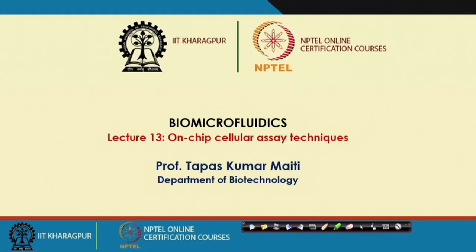In the present time, a number of experiments based on fluorescent microscopy in the microfluidic platform have been adopted to understand biological events. In this lecture, I shall be discussing some of those microfluidic-based experiments using confocal microscopy to understand mechanosignal transduction, which we are using in our laboratory.